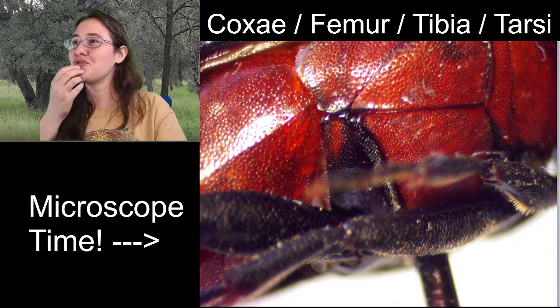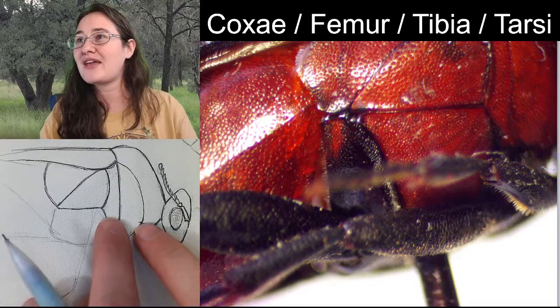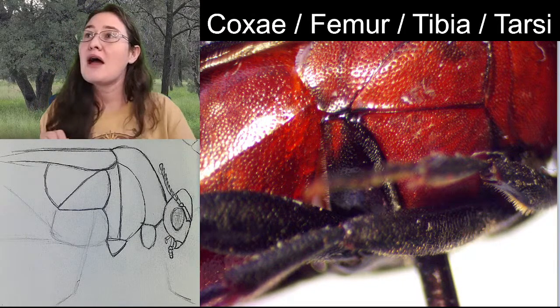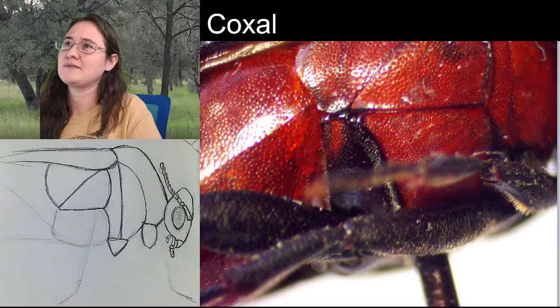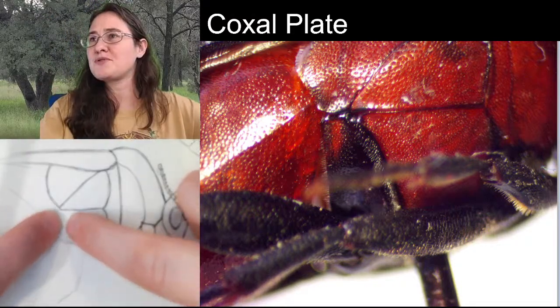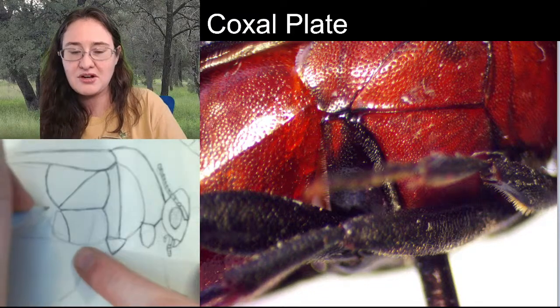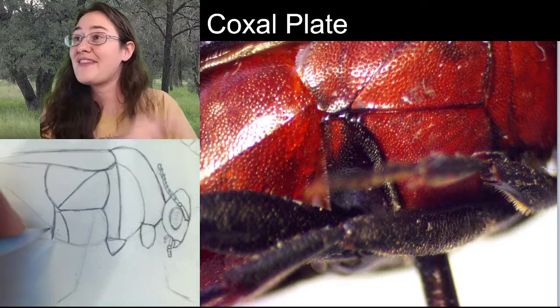All right, so I wanted to show you this because it's something that we regularly see in beetles, and that is that the front leg and the middle leg have coxae that are kind of separated away from the body, whereas the hind coxae, sometimes we even call it a coxal plate, spelled this way. And it's this dark segment, and it's striped right here. So if we were looking at this whole segment that we had sketched, it's not just going to go straight down. You're going to have this segment that curves in and then continues down. And this one right here, that's the dark one, that's the coxal plate.